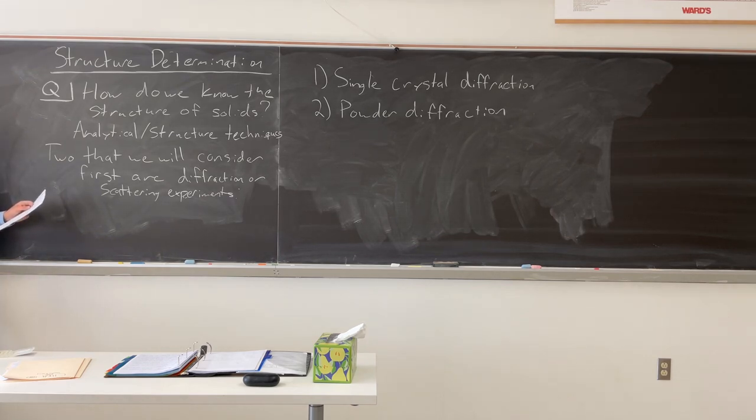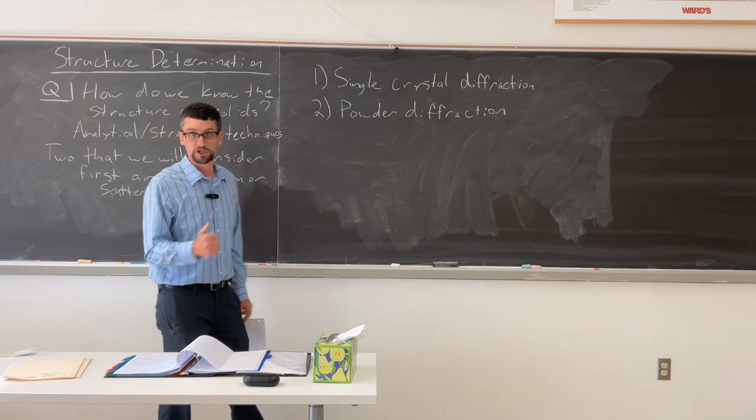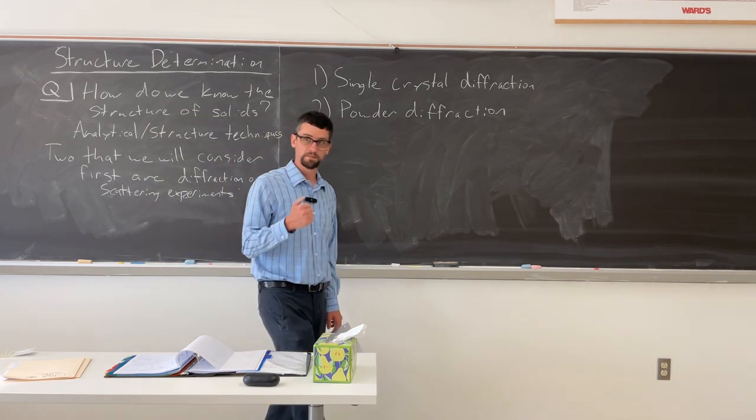Do you guys know what the difference is between these two, or no? Between single crystal and powder. Yeah, a powder, you have a crushed up crystal, basically.